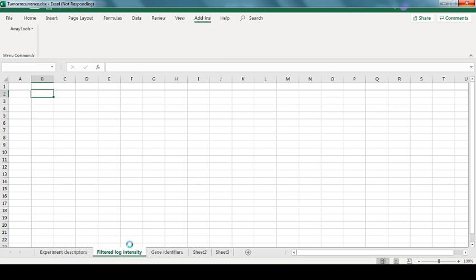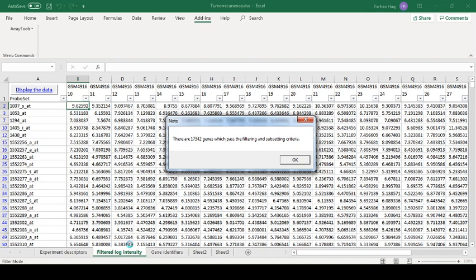Yeah, we have to wait for some time. So these are a few things you should keep in mind. First, everything you have to install for BRB array is explained in the previous lecture, and when you start the processing for the first time, it will ask to install so many different packages. You just have to install everything.